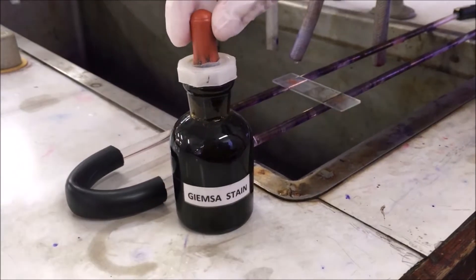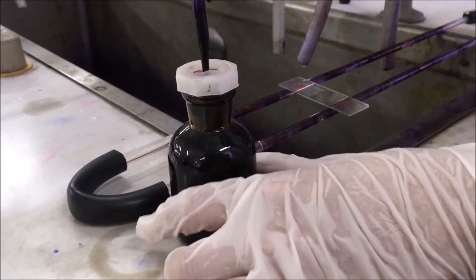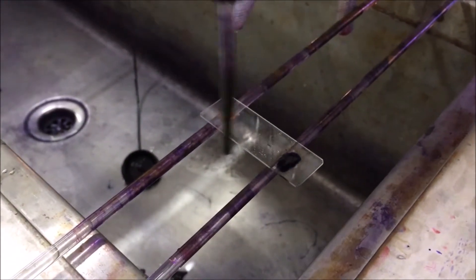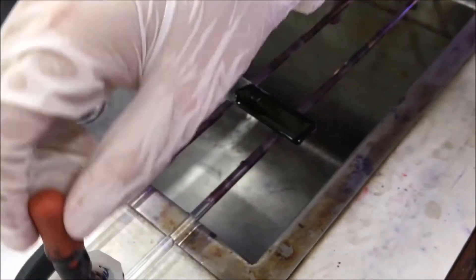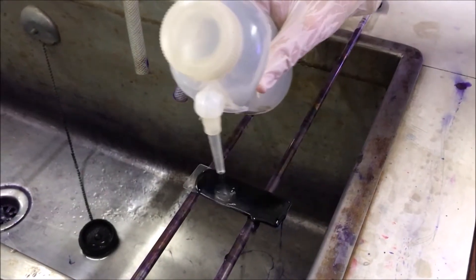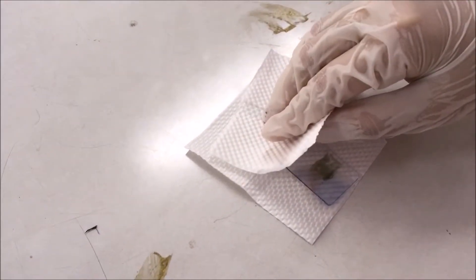Stain the slides with Giemsa stain for 30-45 minutes. Rinse with distilled water. Allow it to dry.